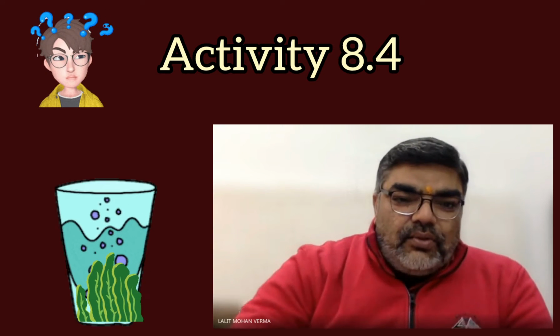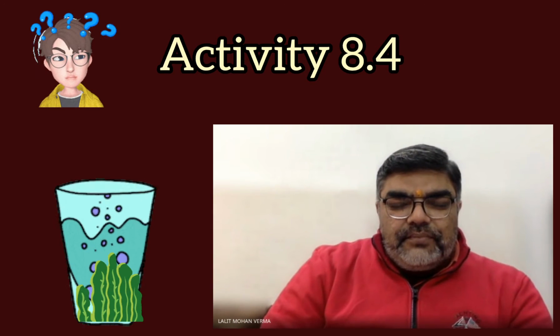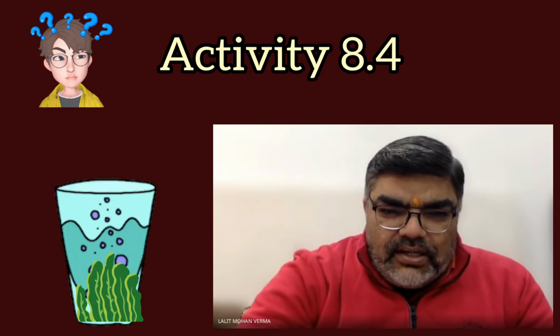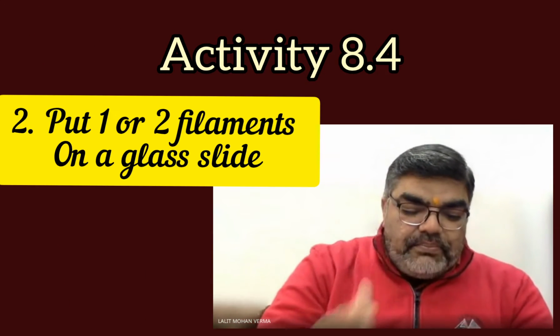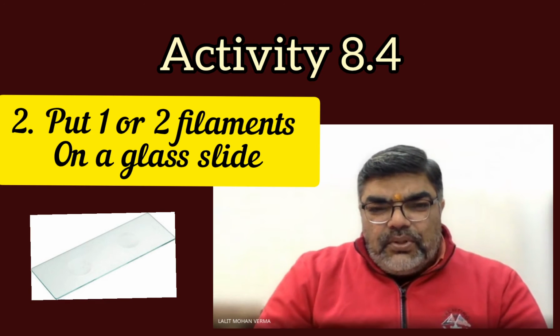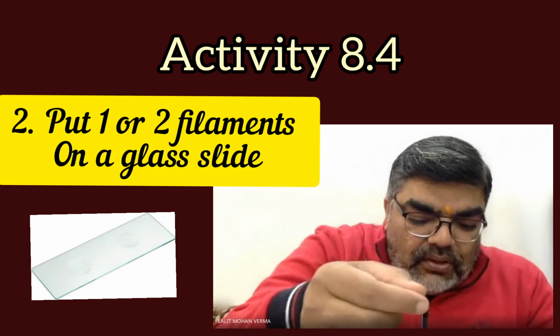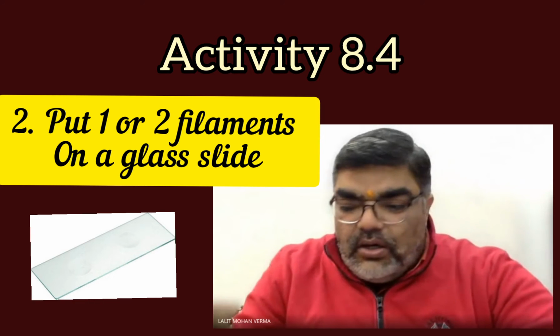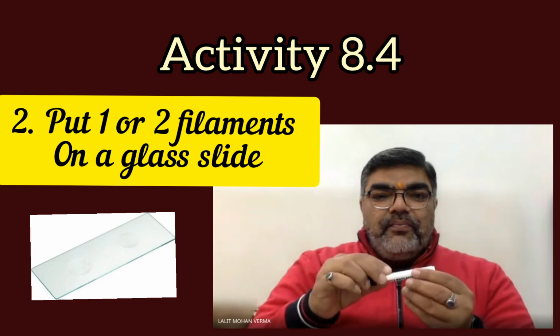So collect the water, okay? Some water containing green filament. Now the second step. Put one or two filaments from this water on the slide.